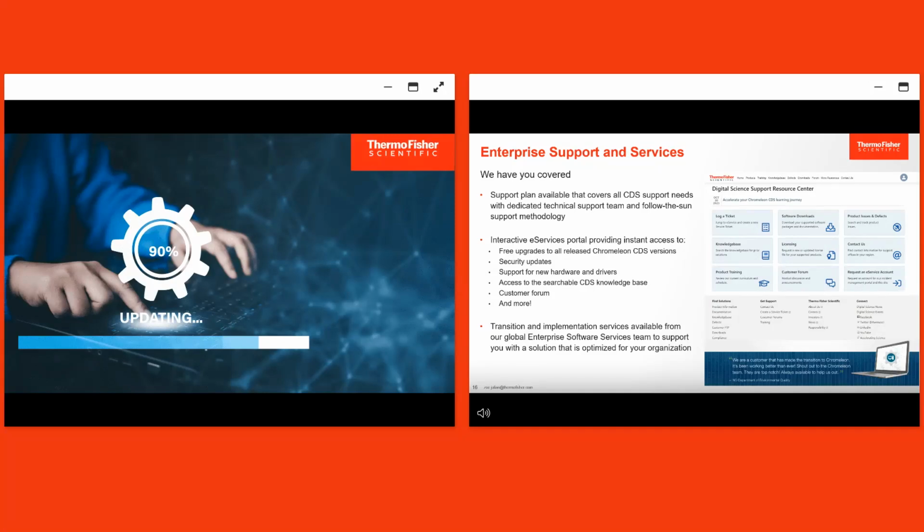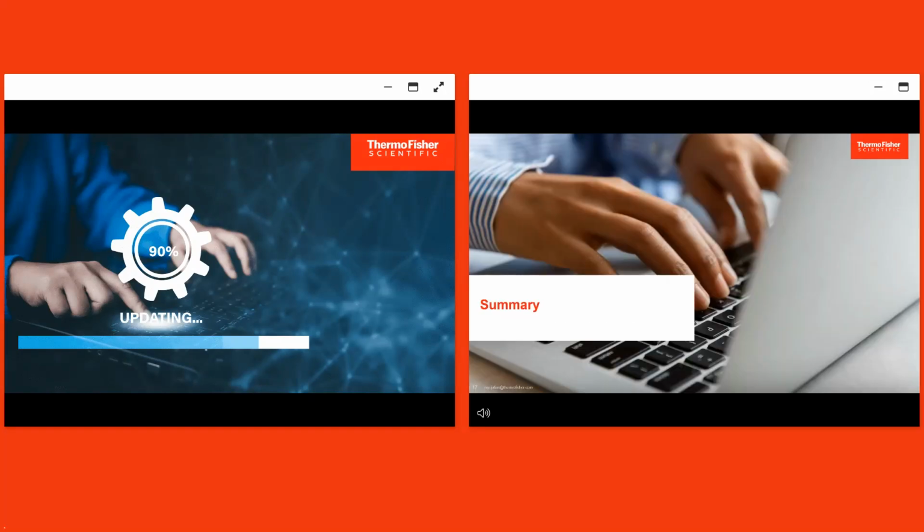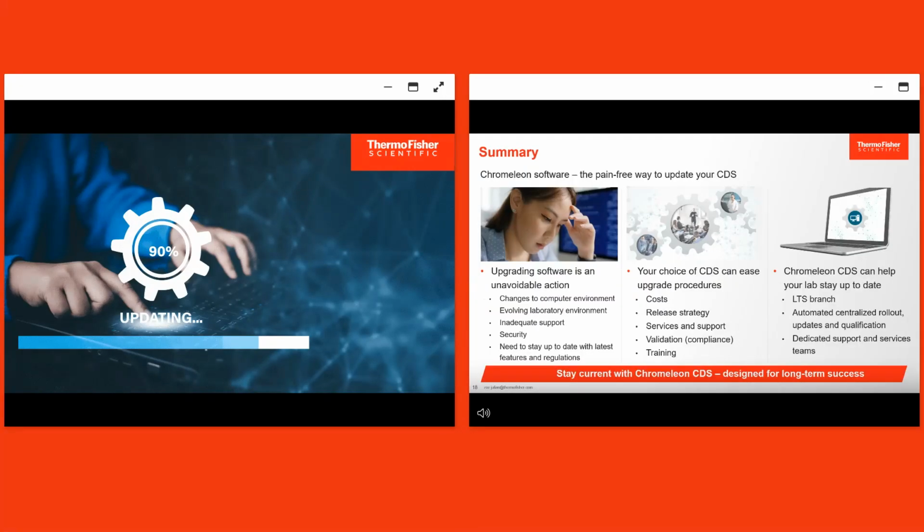Yes, thank you, Shakeil. So we have come to the end of the webinar. I just wanted to quickly summarize what we shared today and just where you can go for more information. So we saw that upgrading software in the laboratory is an unavoidable action. Just like with our phones, we need to keep our CDS up to date. There are many reasons for this, whether it is changes to the computer or laboratory environment, inadequate support for an aging CDS, or the need for security updates or to stay up to date with the latest features and regulations.